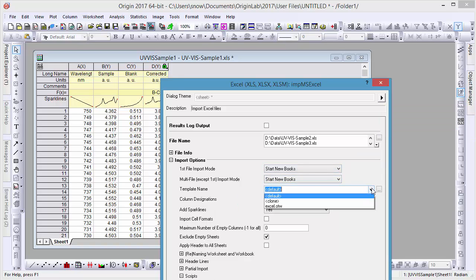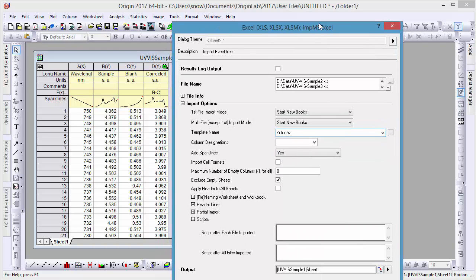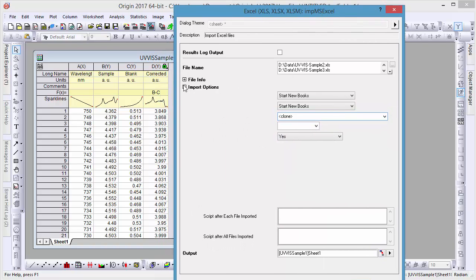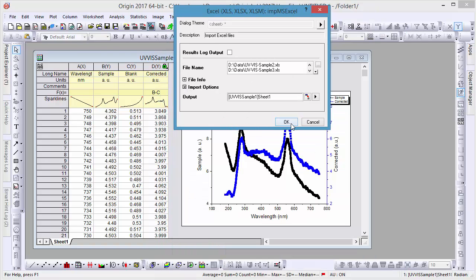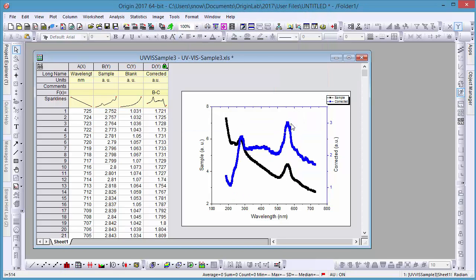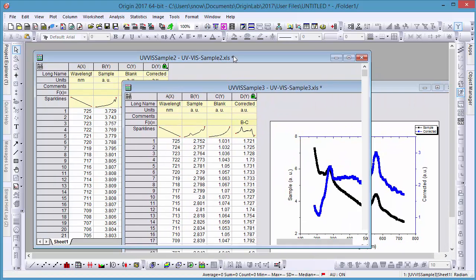Because this data is organized the same way as our previously imported data, we'll set our template to clone. With this setting, Origin will clone the active workbook and then import our new data into it. Therefore, new data will be handled the same way as the previous dataset, with column calculations and the double-Y graph updating accordingly.